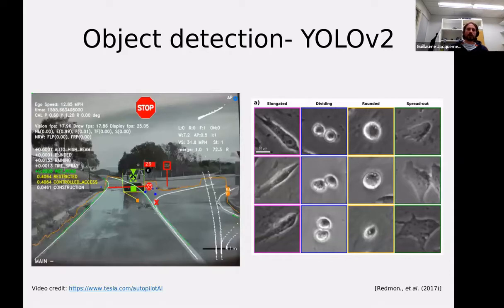One of the big things that you can do with deep learning is object detection. Object detection is a little bit like segmentation, except that you're not generating a mask afterwards. Instead, you are generating bounding boxes. So a deep learning algorithm is identifying objects and structures in your images and telling you where they are.